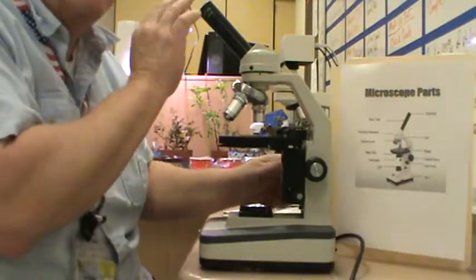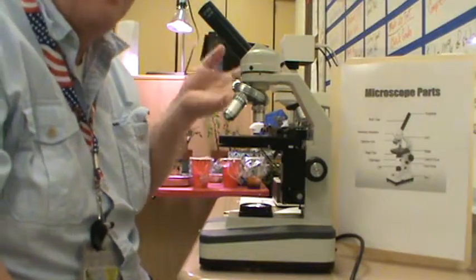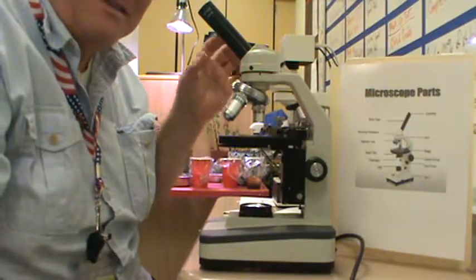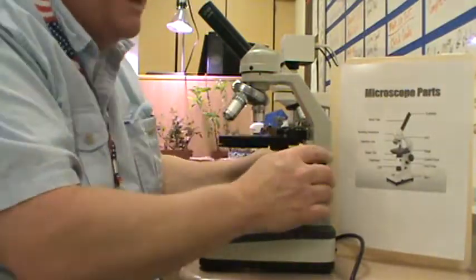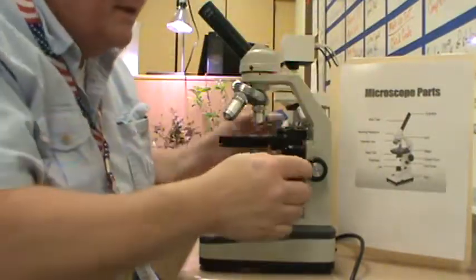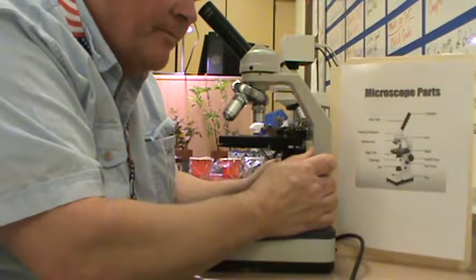If you put your eye right up against the eyepiece, you will find, like several of my young ladies did in the microscope lab, that their eyelashes get in the way. She had these brand new fancy magnetic backed eyelashes, and she had to actually take them off in order to see. But if you have glasses, fine. If you don't need your glasses, I'm more farsighted. I can actually put my naked eye up here, and I can bring this into focus.